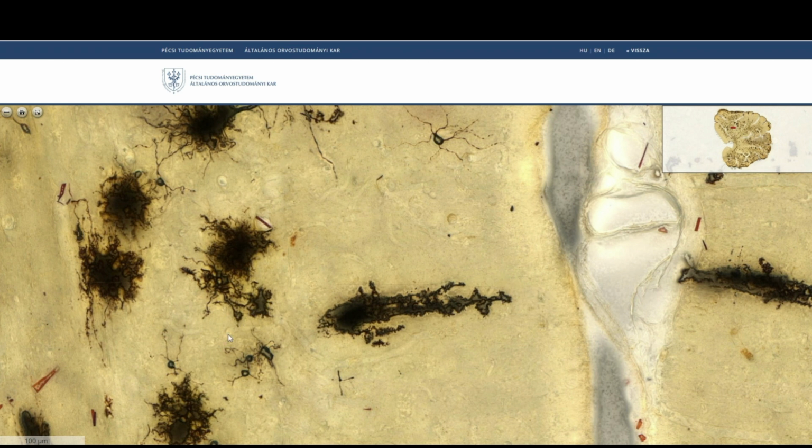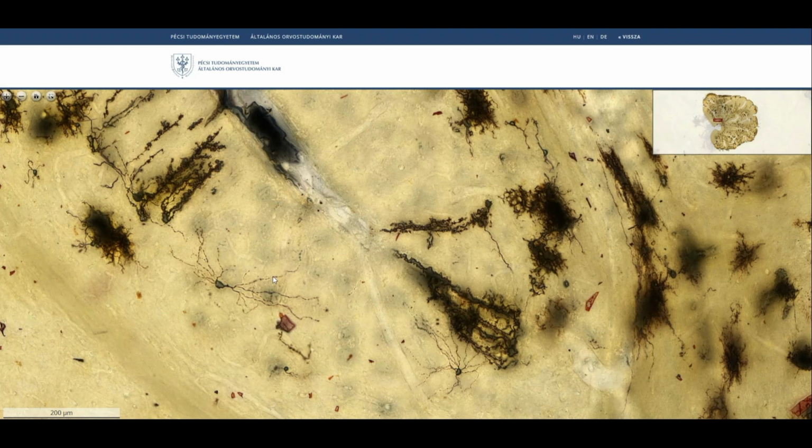In the deeper gray matter layer, in the granular layer, we see some granular cells, and the other messy cells in the gray matter are the protoplasmic astrocytes. In this part of the photo, we see two beautiful basket cells. One is especially very nice because of the extension of the dendrites and axons. The other one shows also transverse running axon, and they are located just above the cell bodies of the Bergman glia cells, so they belong still to the molecular layer this way, located in the deeper part of the molecular layer.